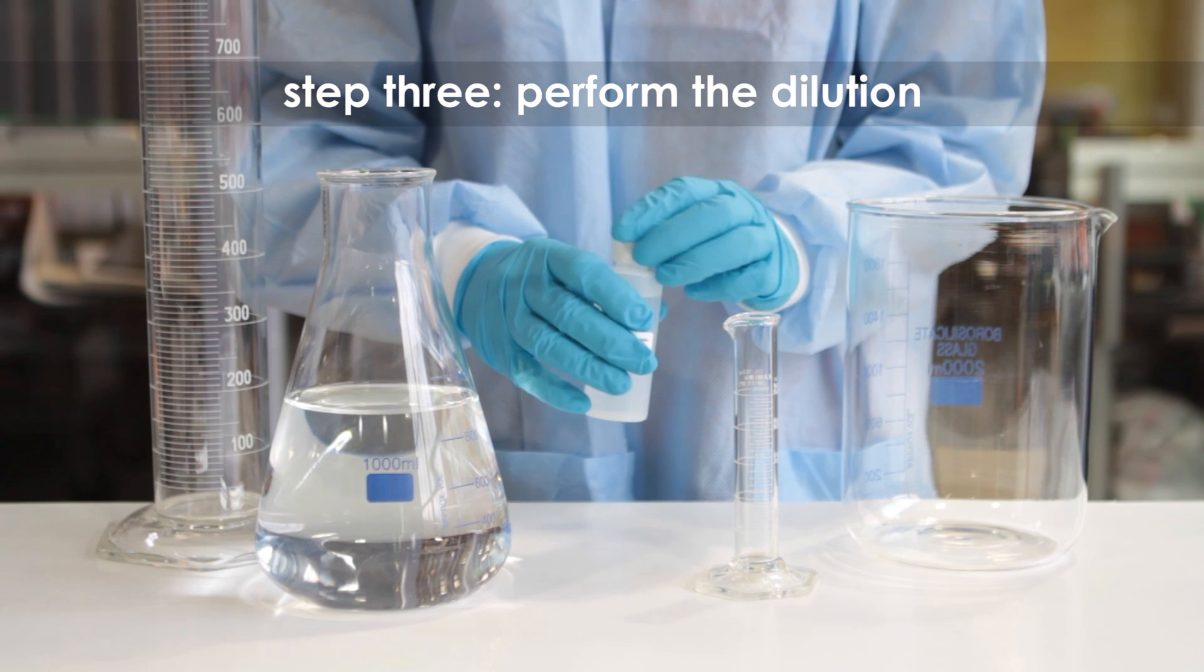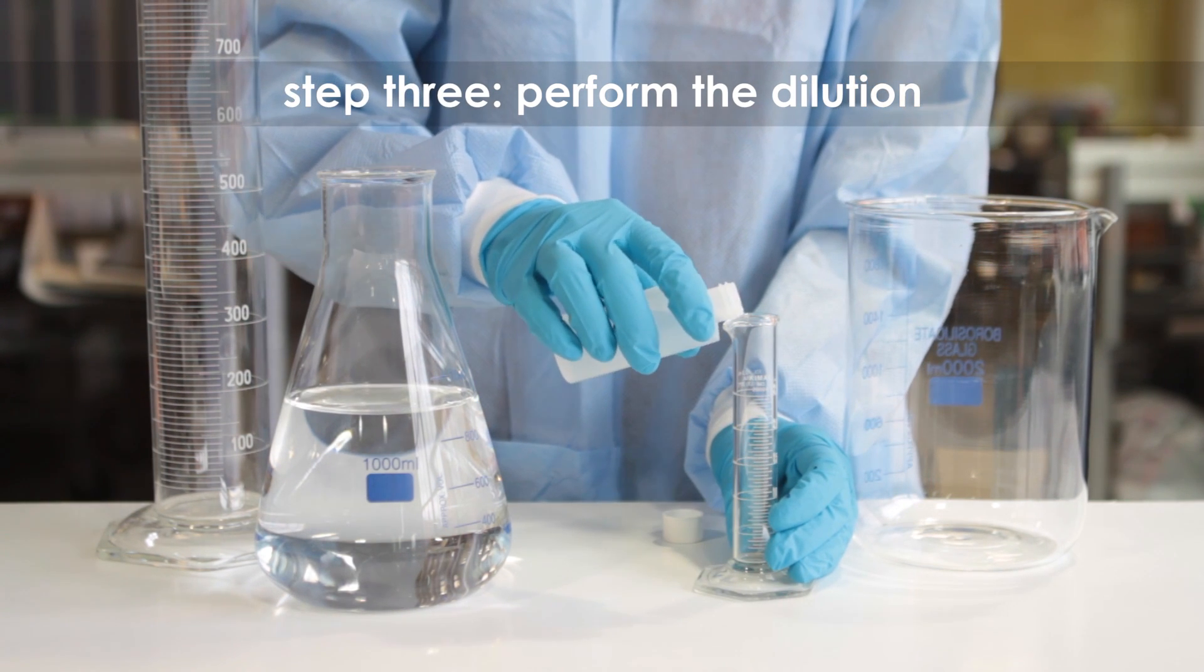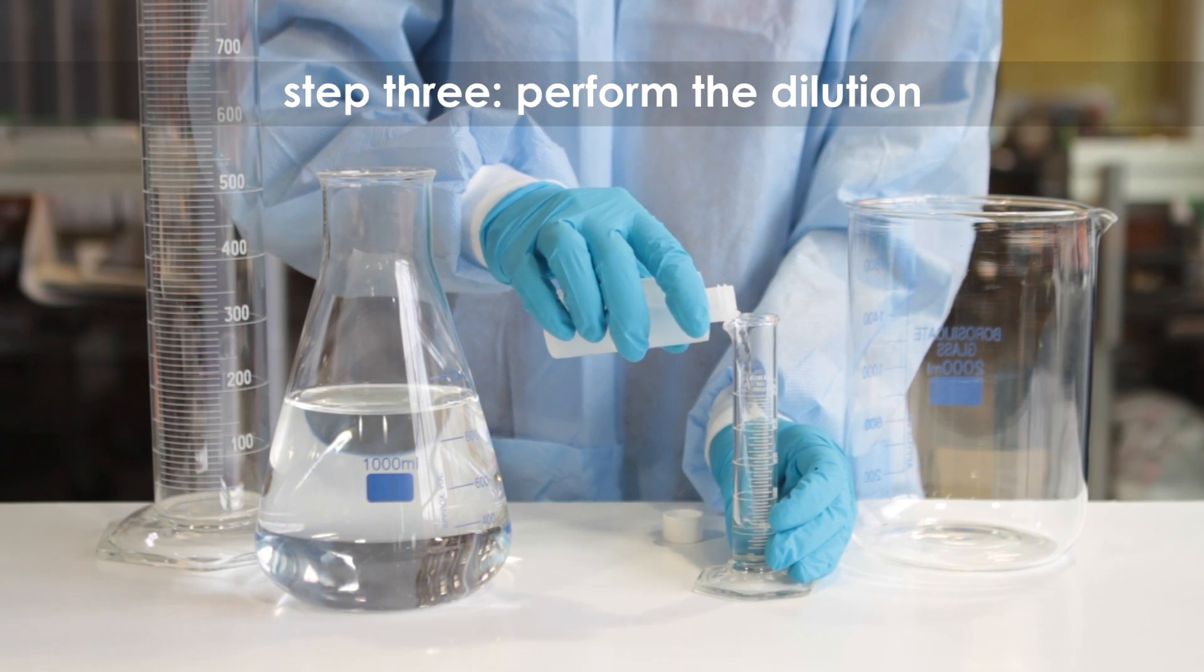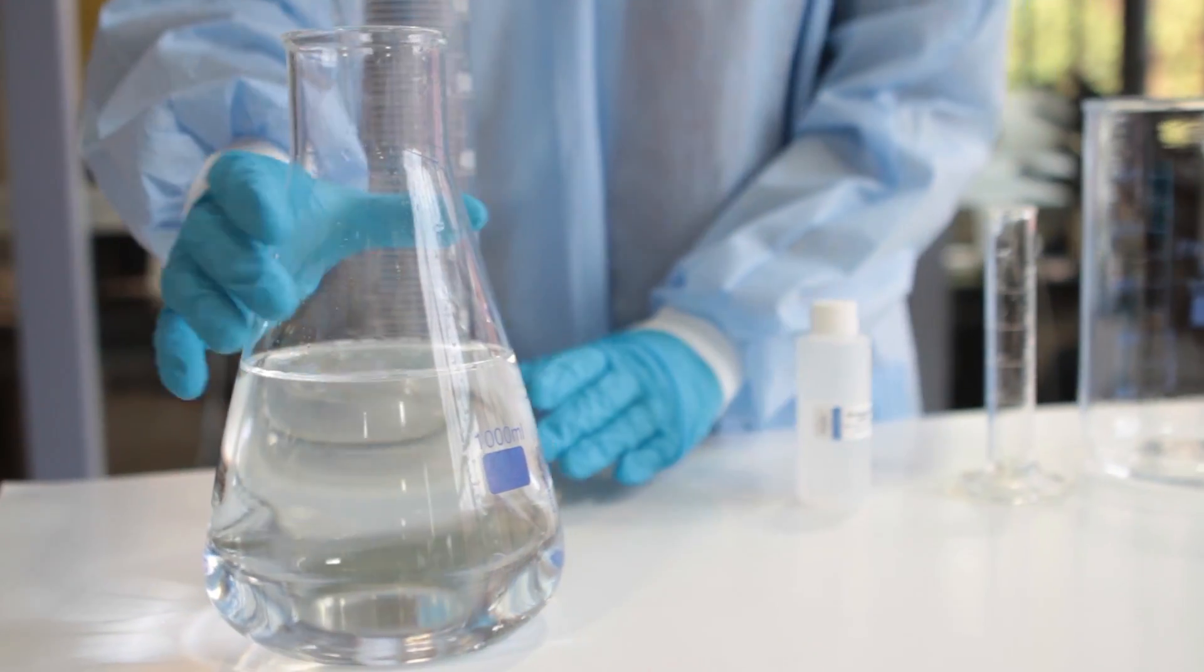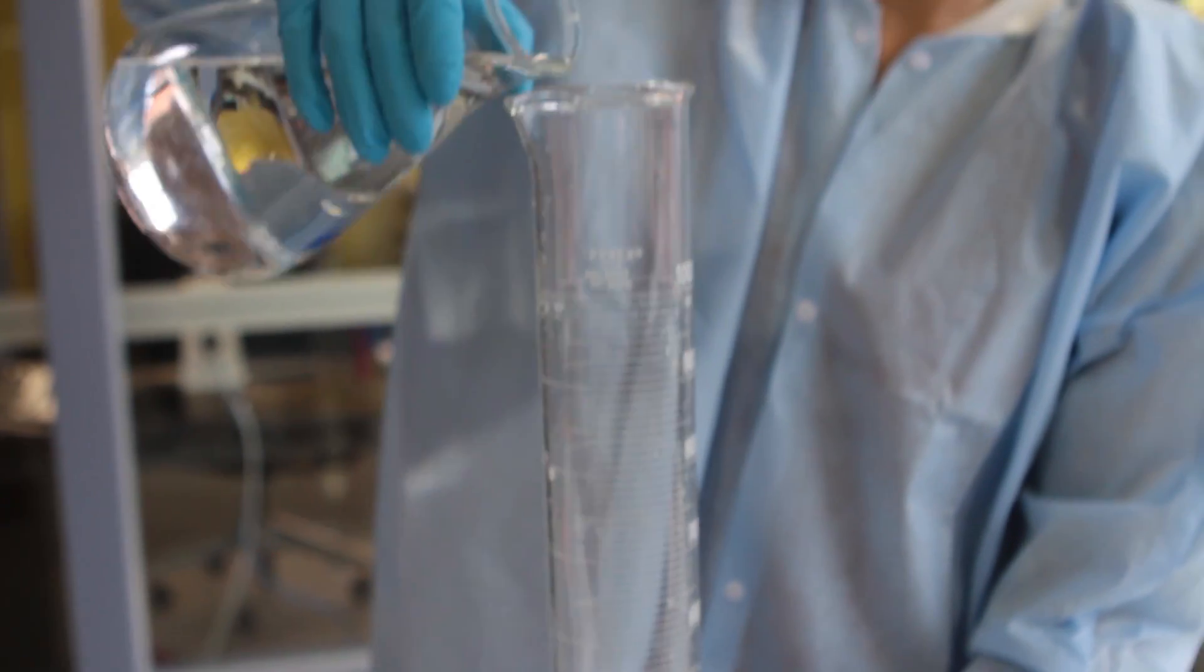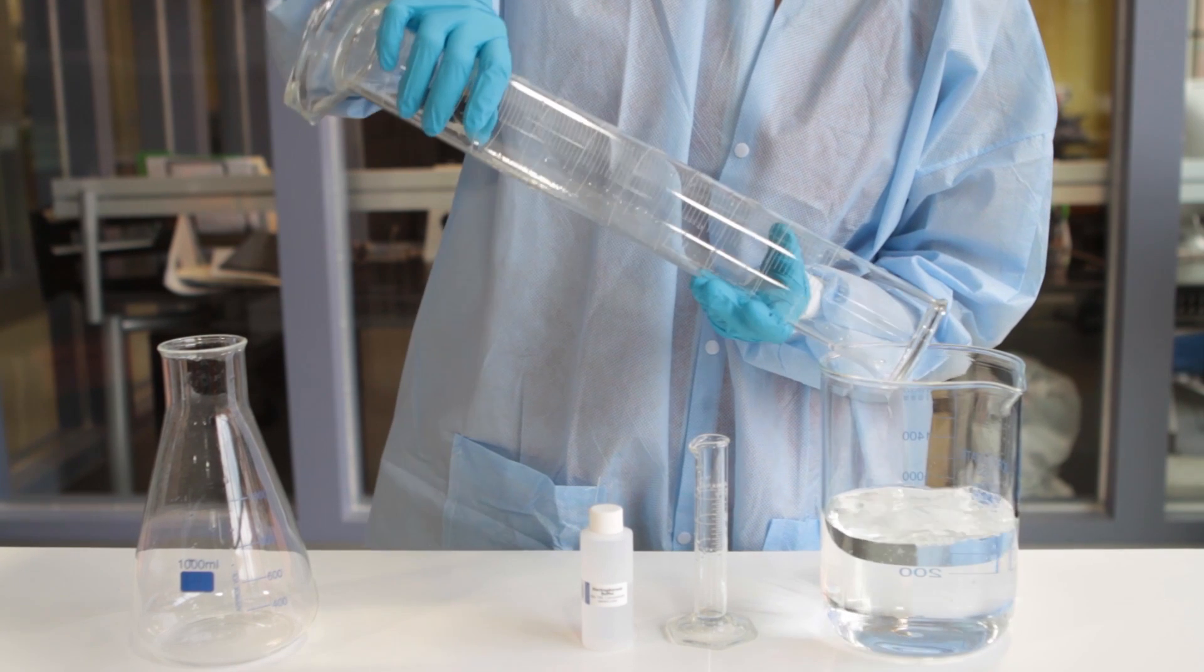Step 3. Perform the dilution. To make 1,000 milliliters of 1x TAE, begin by adding 20 milliliters of the 50x TAE to a large beaker. Next, measure and add 980 milliliters of distilled water to the beaker. After you add the water, the final volume will be 1 liter. Mix thoroughly before using.